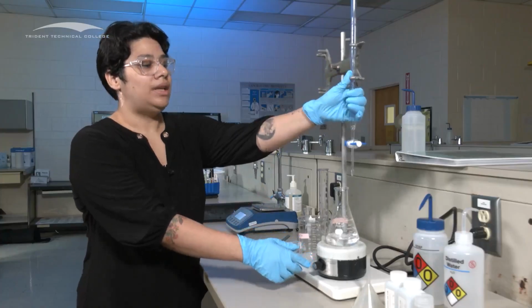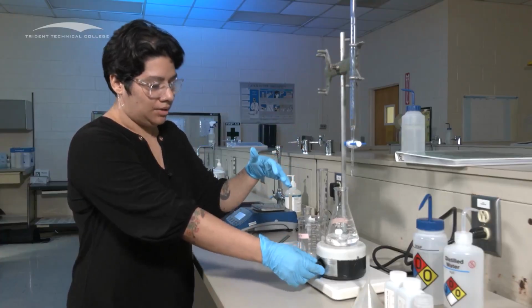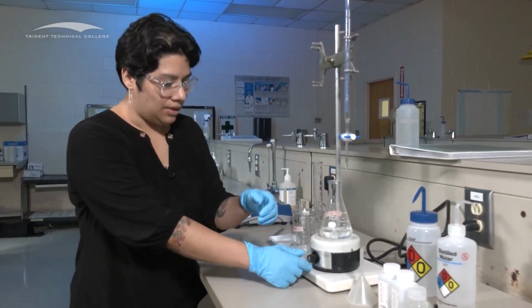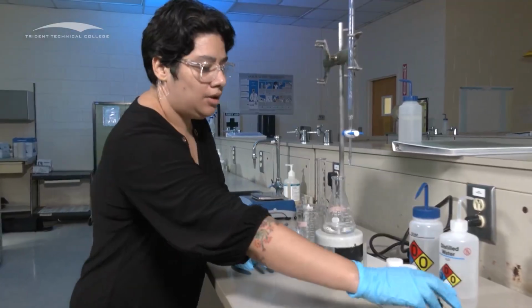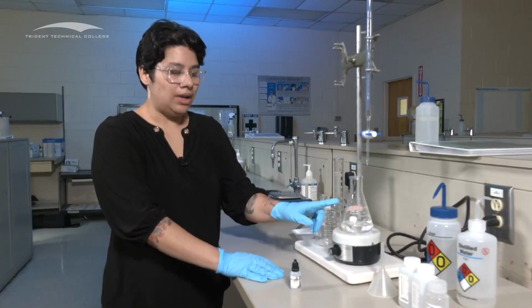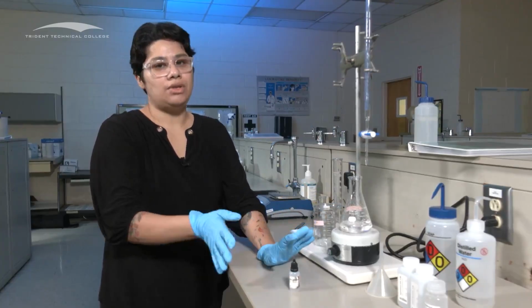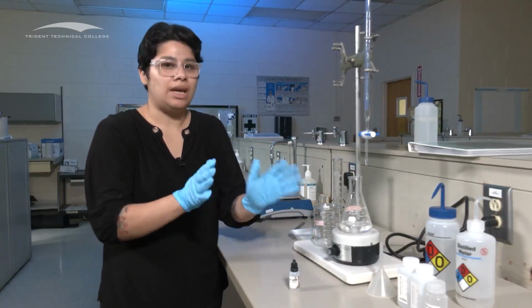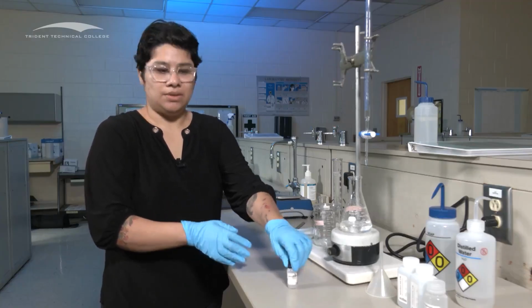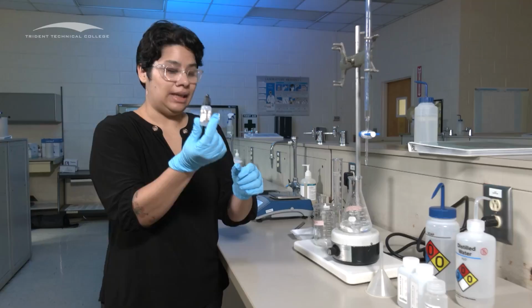So once you are ready to titrate and your burette is full, we are going to start titrating. And then once my stuff is dissolved, you are going to use some of your phenolphthalein indicator, and it's going to go in here. So you can do a pre-dissolve or post-dissolve, 2 to 3 drops. If you put 4, it's okay. If you put 2, it's okay. Just make sure 2 to 3 drops is the ideal. You don't want too much. You don't want too little. So 2 to 3 is our ideal. This is the phenolphthalein indicator.